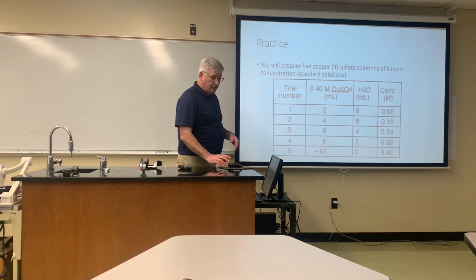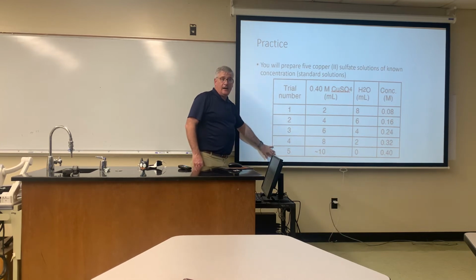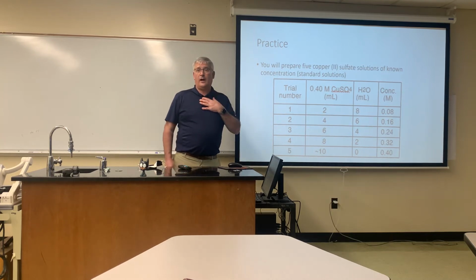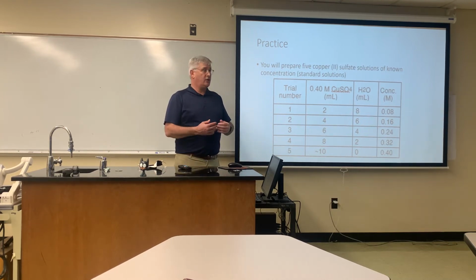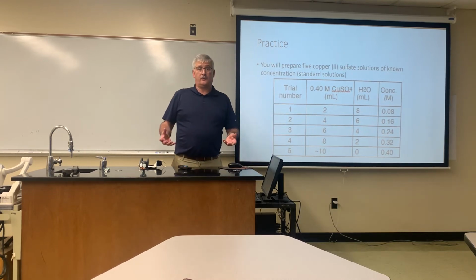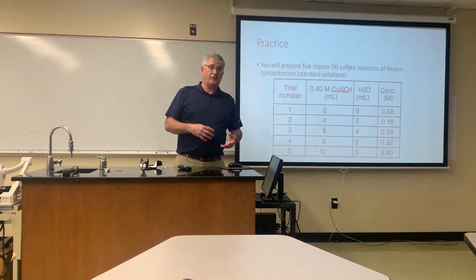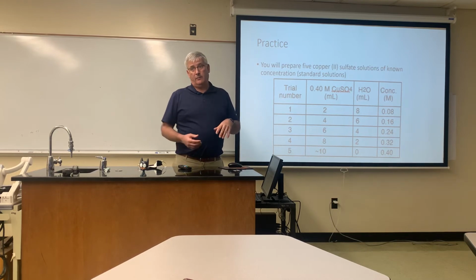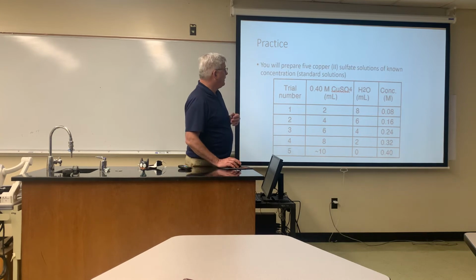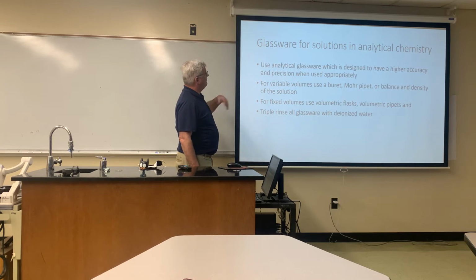We have prepared your unknown to be inside of the low standard and the high standard so you can interpolate to find your answer. It's not common practice in analytical chemistry to extrapolate or to go outside of those values to predict a concentration. If it were outside of that, we would make an additional standard that would be put on the outside of our unknown's point. So that's something you'll need to consider for your environmental project.